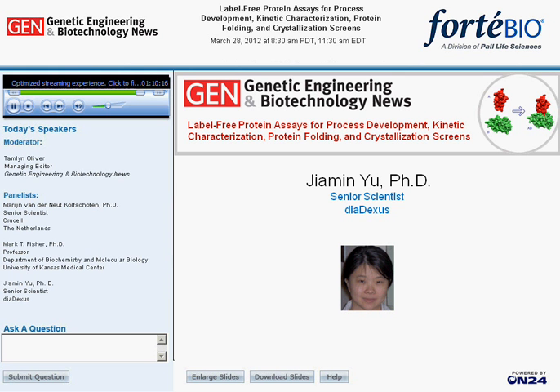And it's very fast. Does your method work with NTA sensors? I think very early on when I was trying to develop this method, I thought about the NTA because you can strip it and then recoat the sensor.